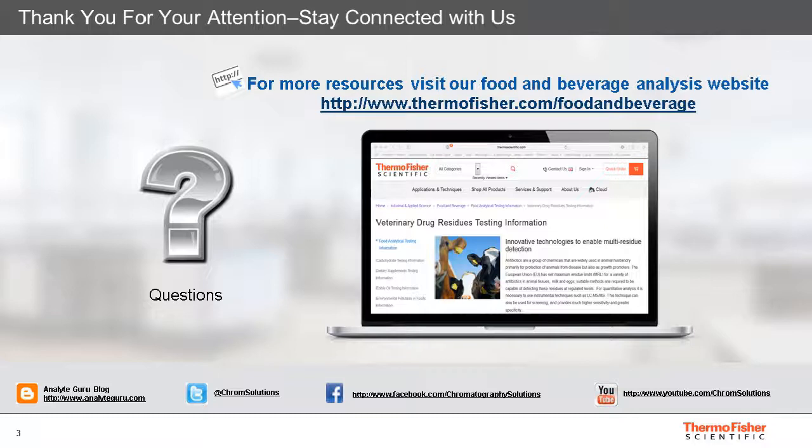Thank you, Richard. And the next question again for you, Richard. Is it possible to use the IC method for trace analysis of polar organic acids like trifluoroacetic acid? Yes. We haven't tried to analyze those compounds alongside the ones we discussed today under these conditions, but yes, it's possible. You may have to change the conditions slightly. Okay, thank you very much.